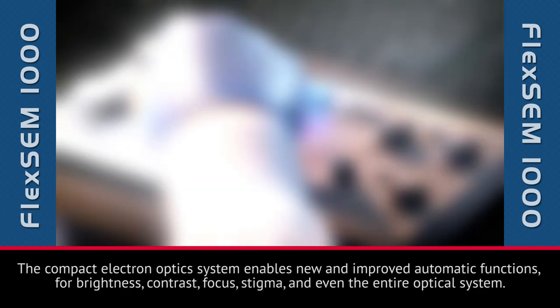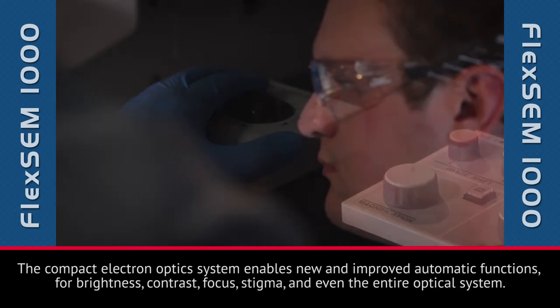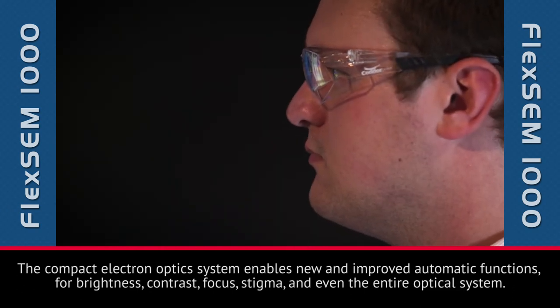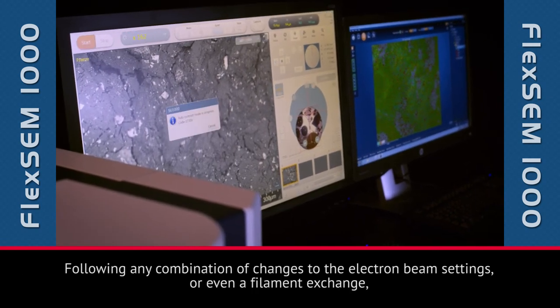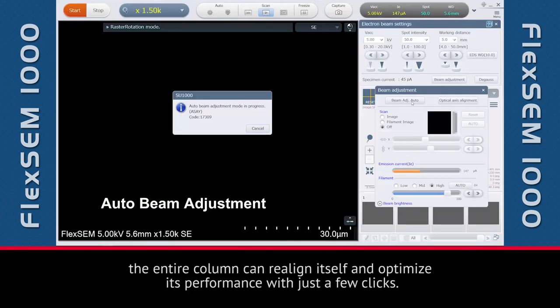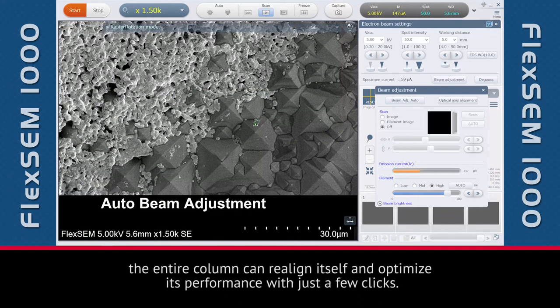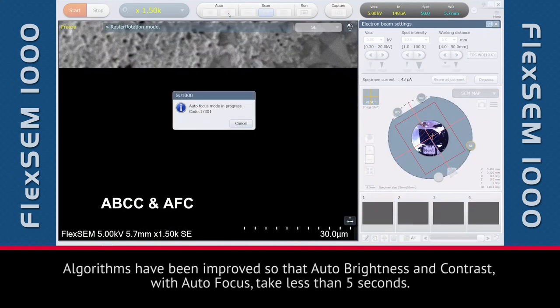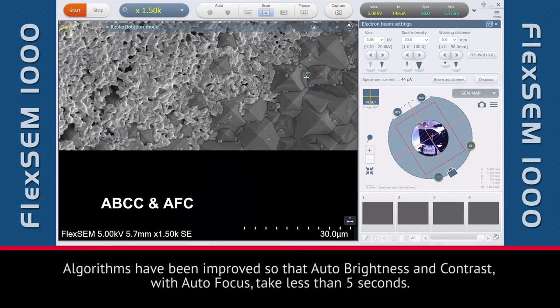The compact electron optics system enables new and improved automatic functions for brightness, contrast, focus, stigma, and even the entire optical system. Following any combination of changes to the electron beam settings, or even a filament exchange, the entire column can realign itself and optimize its performance with just a few clicks. Algorithms have been improved so that auto-brightness and contrast with auto-focus take less than five seconds.